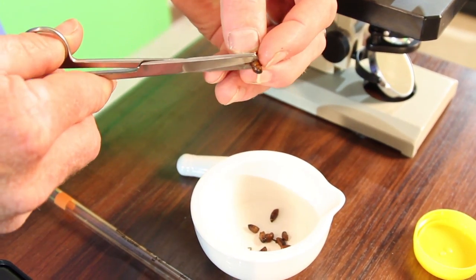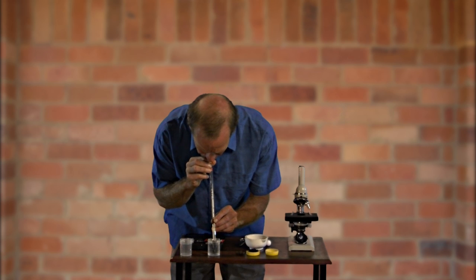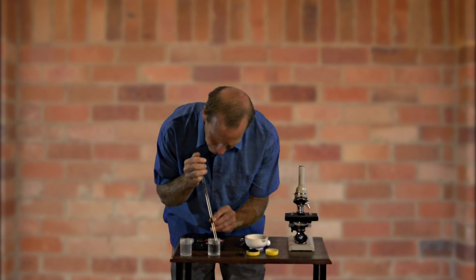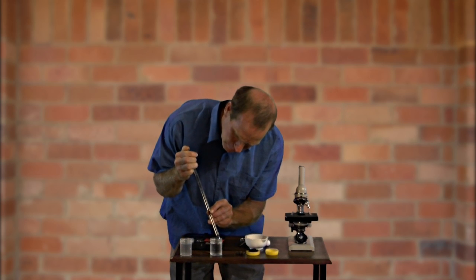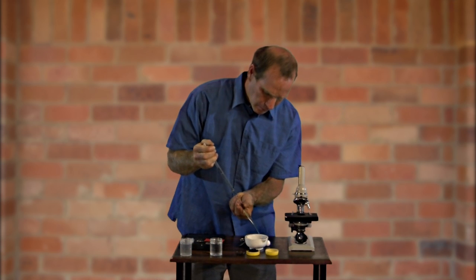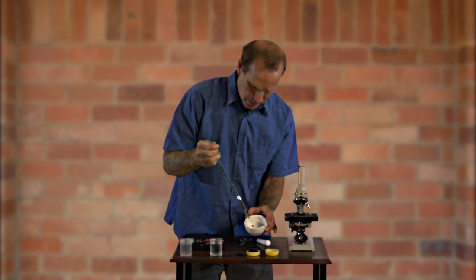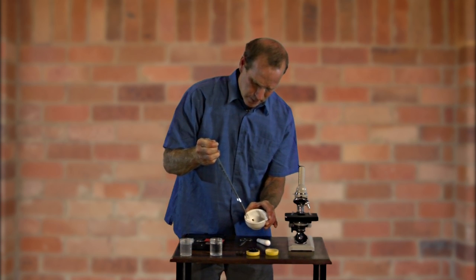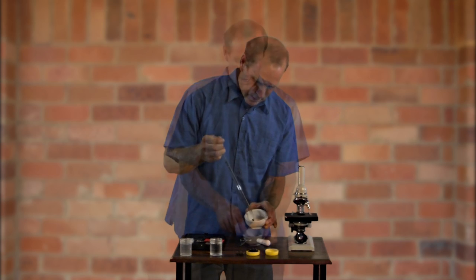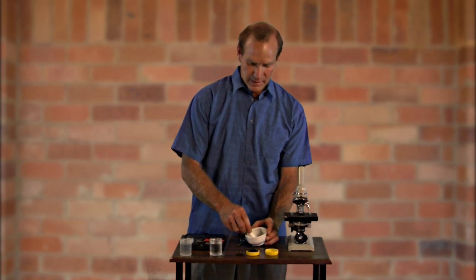I need to add 10 mls of water to that as well. So I'll just suck that up and place that in there. So now we've added the water, we've got the bee abdomen, so it's just a matter of grinding those bees up. The recipe for it is per one abdomen, it's one ml of water.